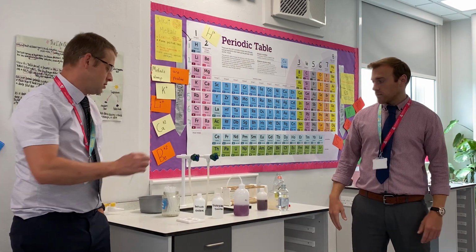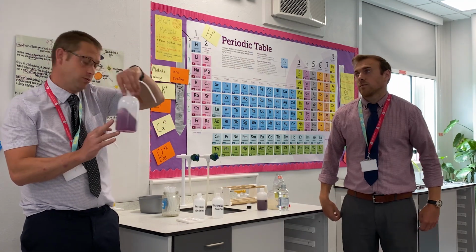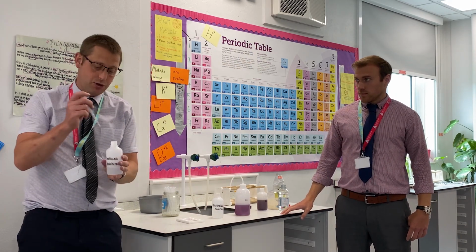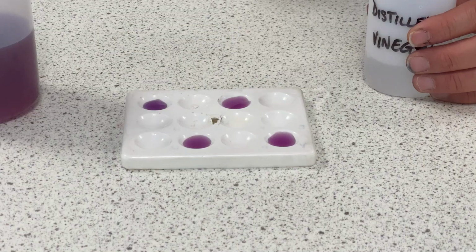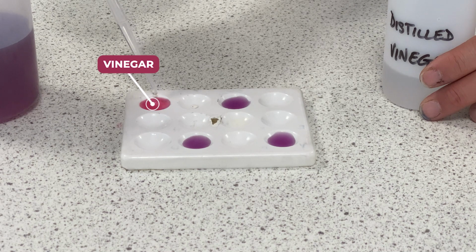Before we start, we're going to remember that the neutral colour is purple, and that we're going to be using 2 common household chemicals that you should be familiar with. Vinegar, okay, which when I've dropped it into the pipette there, into the dimple tray, we can see that it's turned a nice pinky red colour away from the purple.